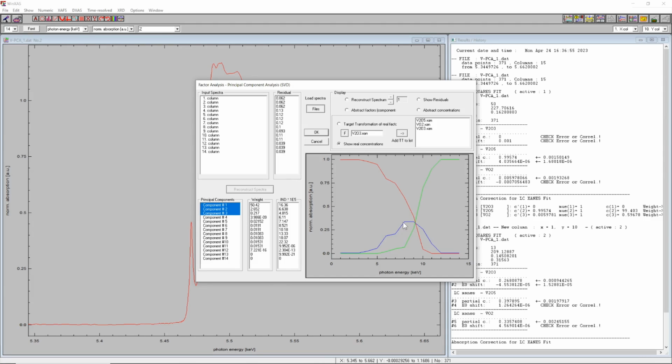You see that it works, and the concentrations we determine here correspond to the concentrations of those references in the constructed experimental spectrum. But it's not only a proof of principle, it also shows a best case scenario. This is basically the example where the structure of your reference compounds perfectly matches the structure of the chemical phases present in your phase mixtures.